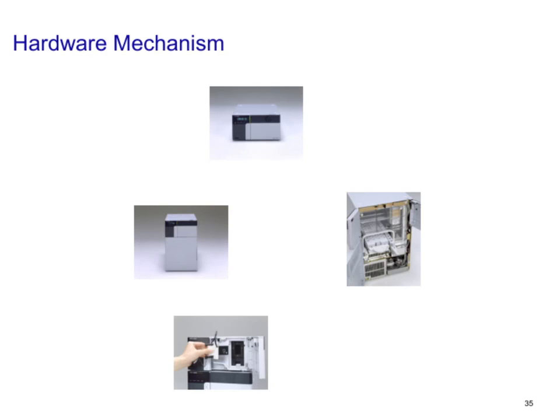The choice of pump is crucial because it affects the flow rate, pressure, and overall stability of the detector operation. Different pump types, such as diaphragm or piston pumps, have unique advantages depending on the application's requirements.